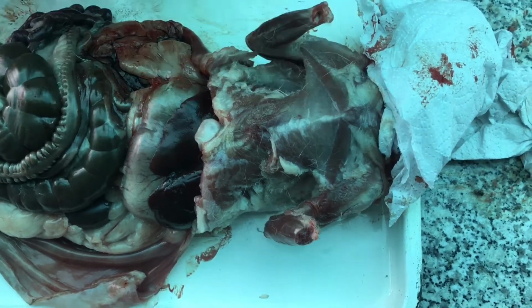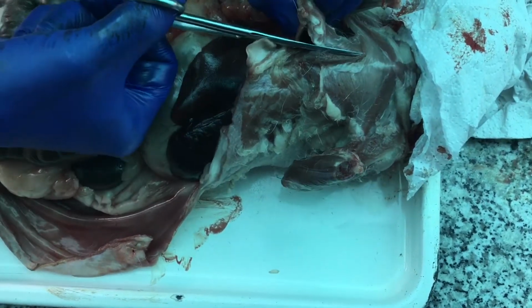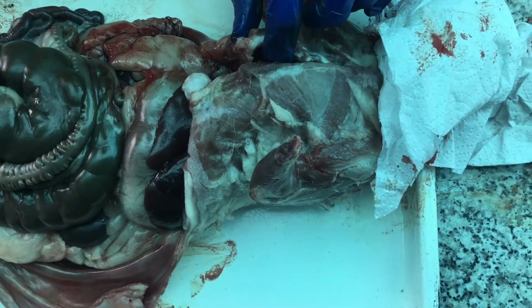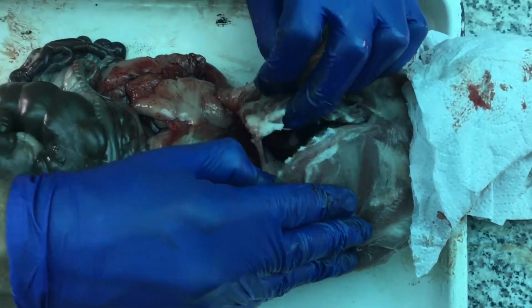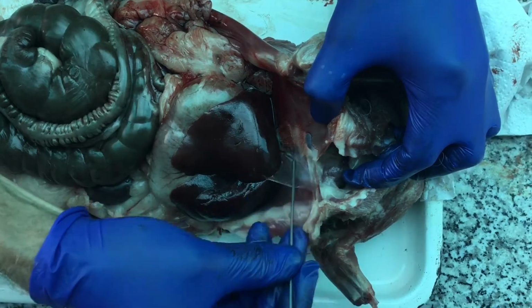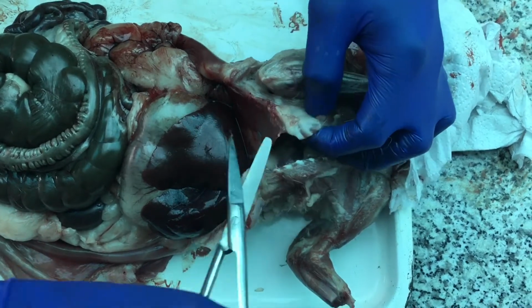In this case, it's going to be the chest cavity where we're going to find the heart and the lungs. So if we continue our cut anteriorly, right along the midline, or I'm actually going to cut a little bit off to the side, right up into the chest, you can see I'm cutting through what are mostly the cartilage and cartilaginous ends of the ribs. And I'm going to try and see if I can open this up in a way that you can appreciate the diaphragm as I do it. So here's the diaphragm. Probably, I could cut around the sides and the diaphragm will mostly be in place, and I'm just cutting the diaphragm away.